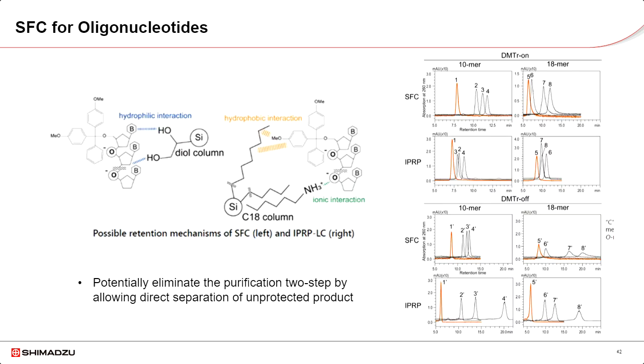As seen here, the 10-mer separations conducted in SFC conditions were nearly equivalent whether the oligos were protected or not. This may allow for certain oligos to have that two-step purification process be eliminated by separating directly in either the protected or deprotected mode.